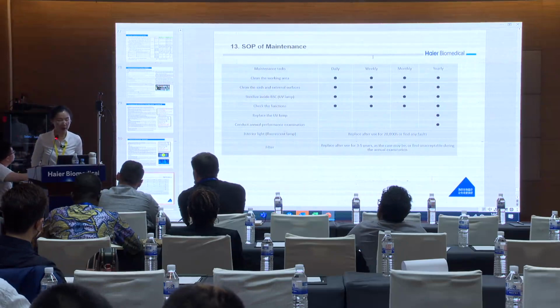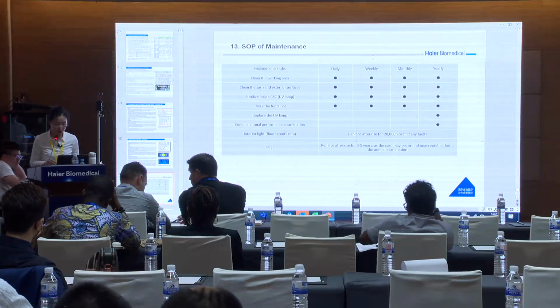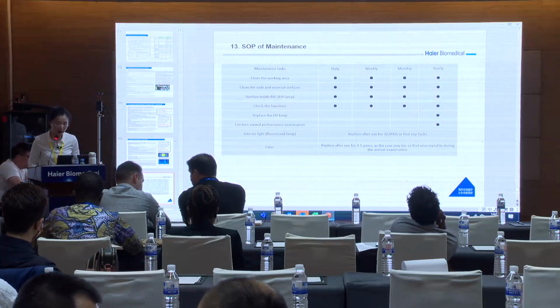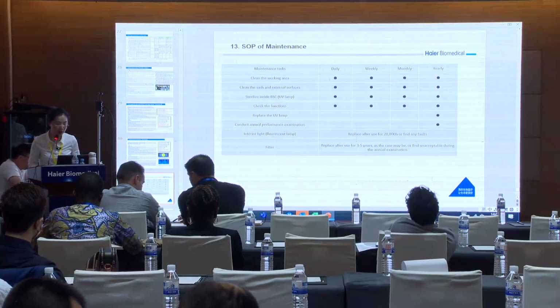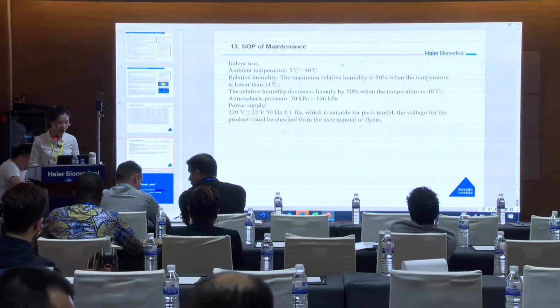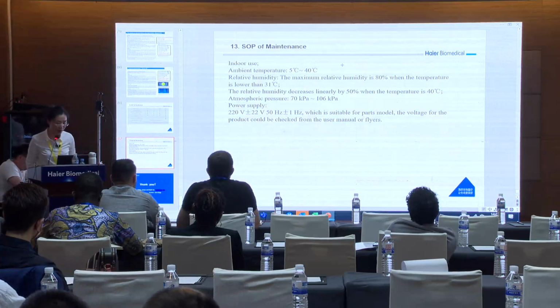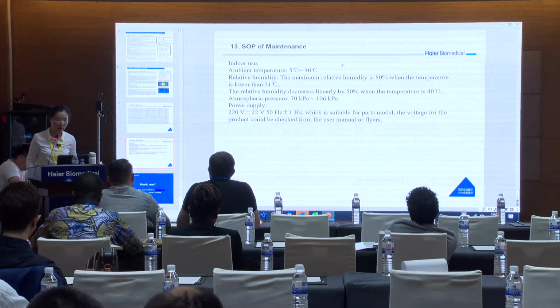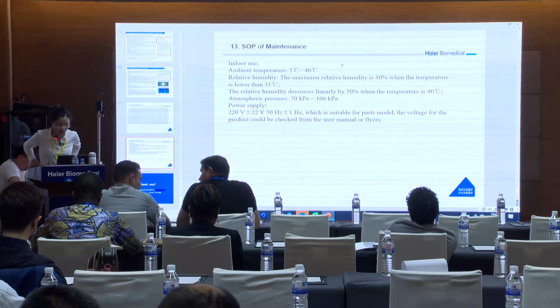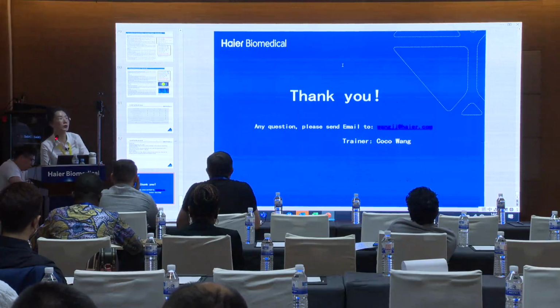And this part is some SOP maintenance. You could follow these steps, maintenance tasks, daily, weekly, monthly, or yearly by yourself. And the last part is our recommended installation environment. Thank you very much. And now we will show you our real equipment.